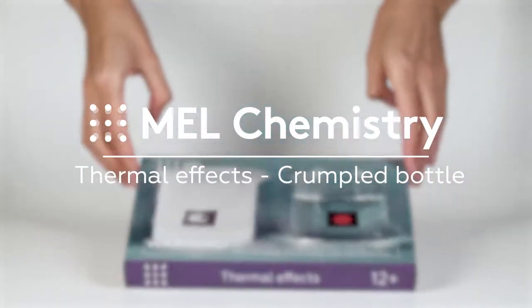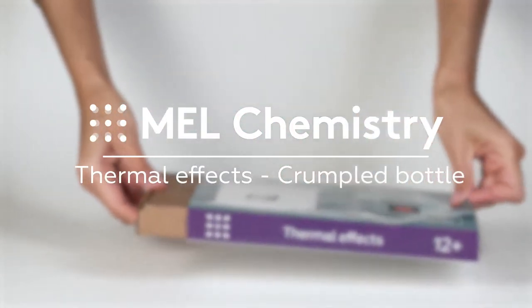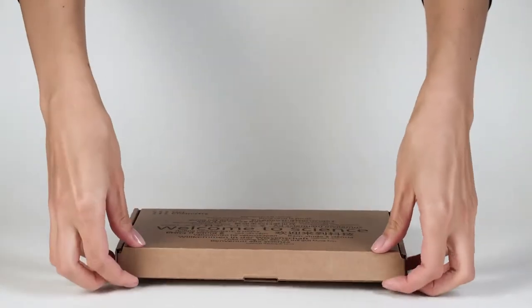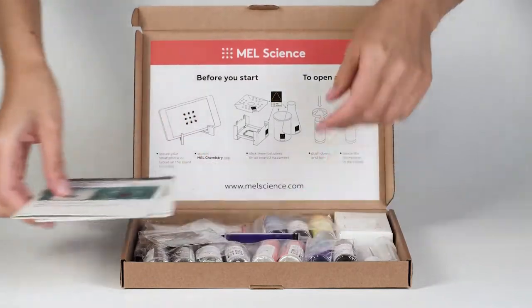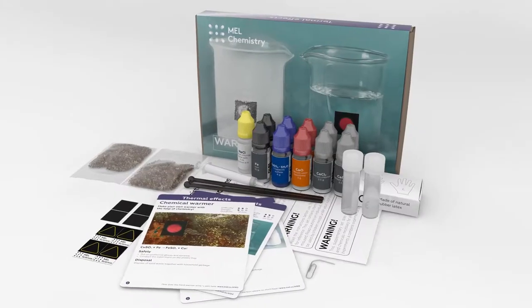Welcome to the wonderful world of chemistry. Today, with the help of the Thermal Effects Set by Mel Chemistry, we will see how a plastic bottle deforms due to the heat produced by the chemical reaction.